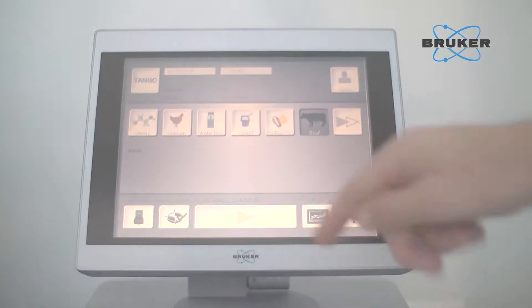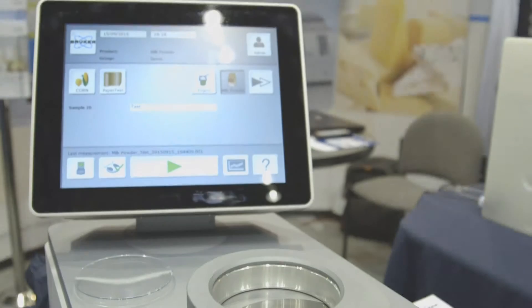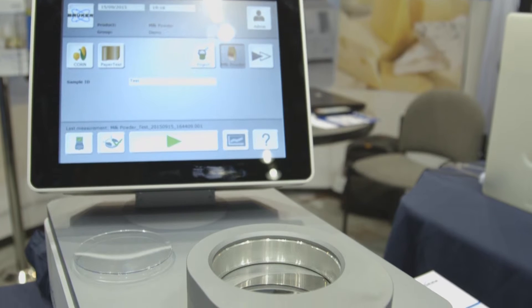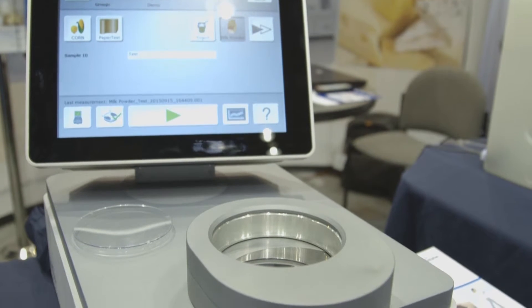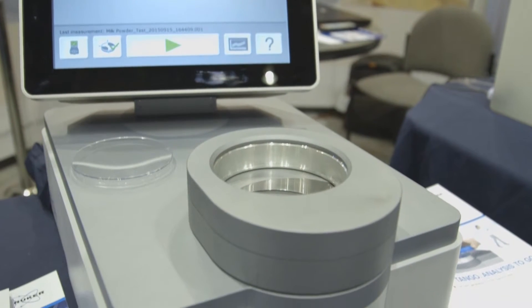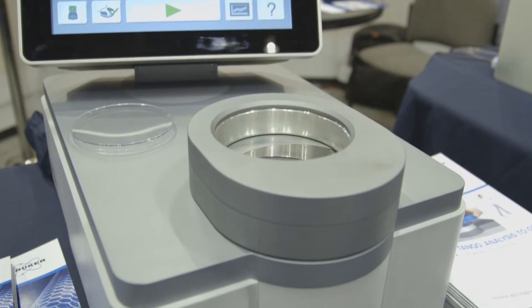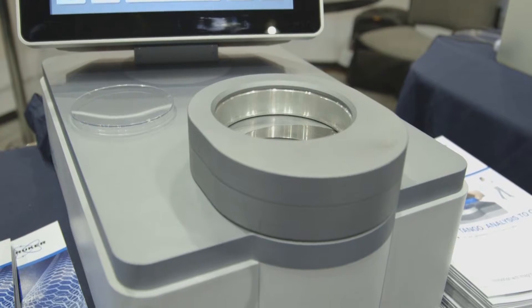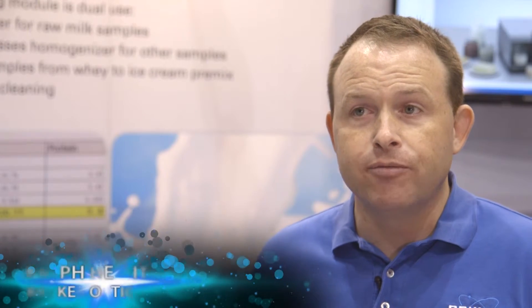With the Tango, there is no easier instrument to use in the marketplace. Analyze for moisture, fat, protein, fiber, and ash in raw materials in a feed mill, the mixed feed or the blended feed, as well as the finished product.